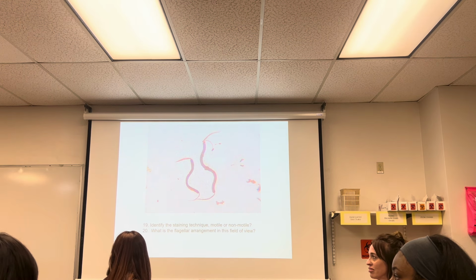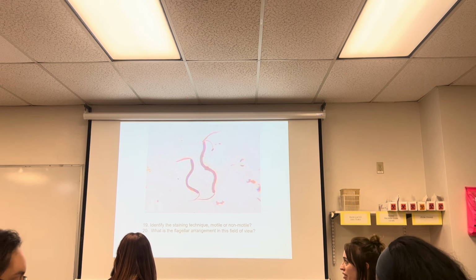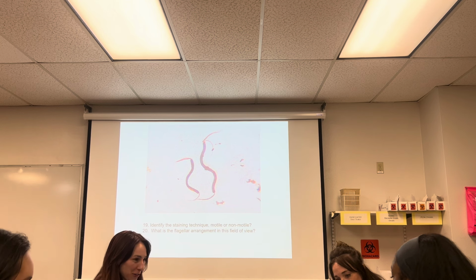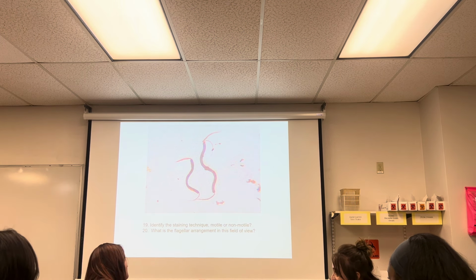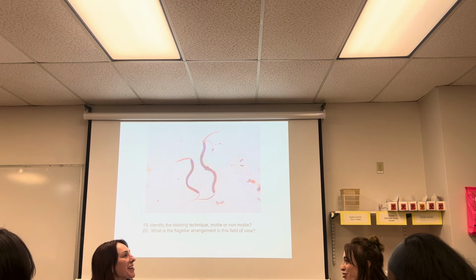Remember? And then what's this one? Sorry, that was the Peritrichous. A lopho, a tuft. It's a loaf of them. No, because then I think of a loaf of bread. No, I don't know. A bunch of layers.